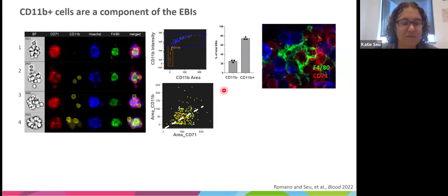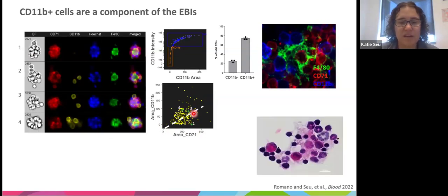And this ratio, if you do a linear regression and get the slope of this line, it ended up being a really consistent number for multiple preps, suggesting that this is really like a physiological balance. And not only that this is a real interaction, but that this is something that maybe we can use as a readout of the proportions of the cells in the islands.